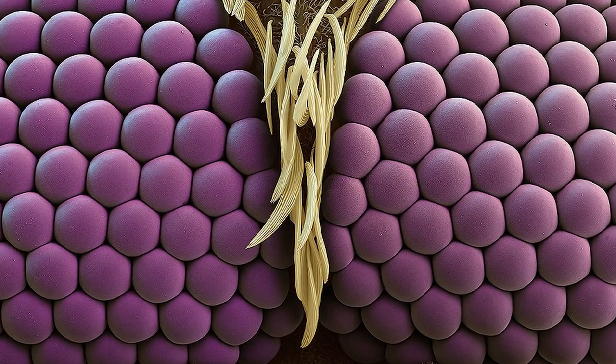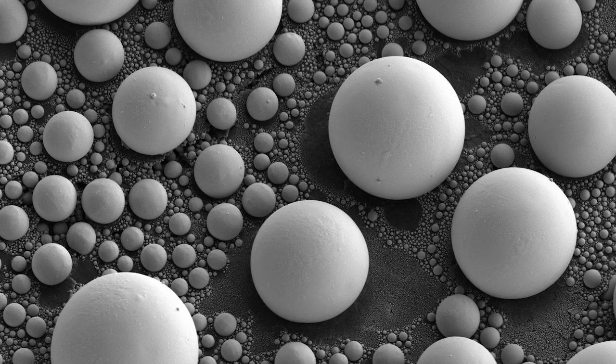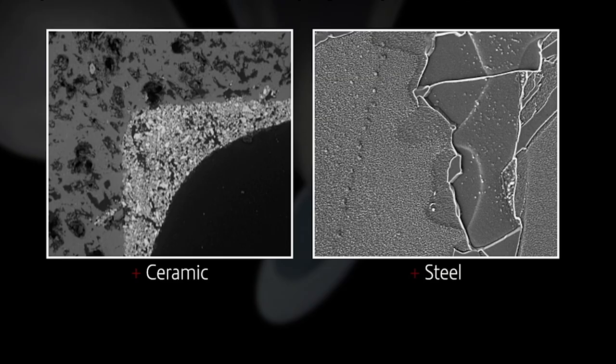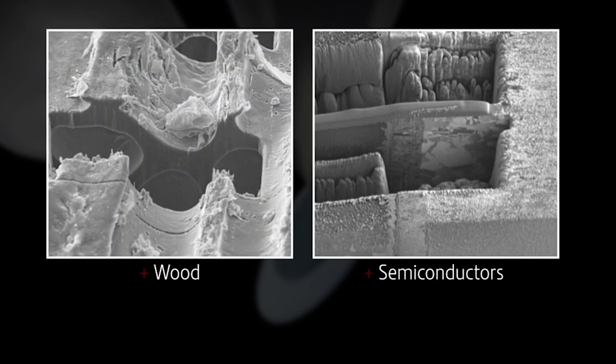Biologists use electron microscopes to examine the structure of cells, bacteria, viruses, and colloidal particles. Scientists who are concerned with material characteristics want to observe inhomogeneities and faults in metals, crystals, and ceramic materials. In geological fields, the electron microscope allowed the detailed studies of rocks, minerals, and fossils, and to understand the origin of our planet and its valuable mineral resources. Modern electron microscopes not only display, but also analyze, measure, and modify in 2D, 3D, and even 4D.